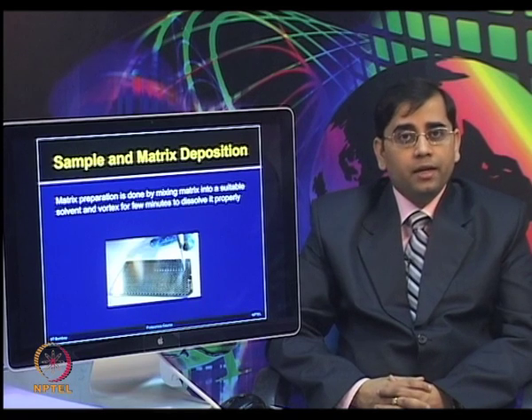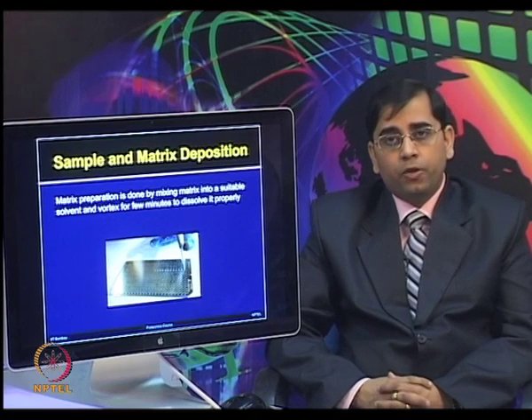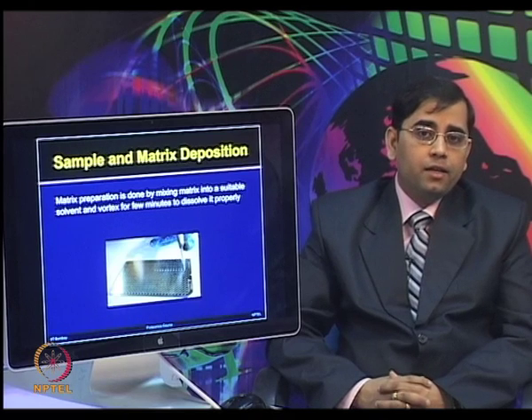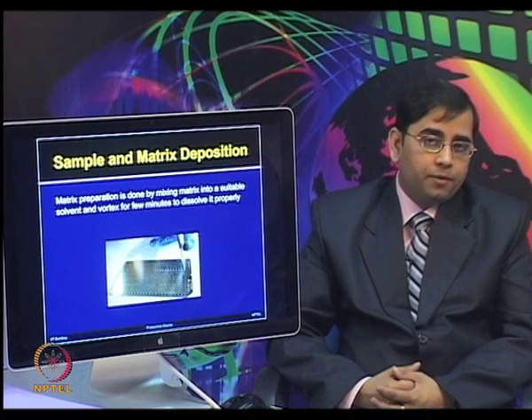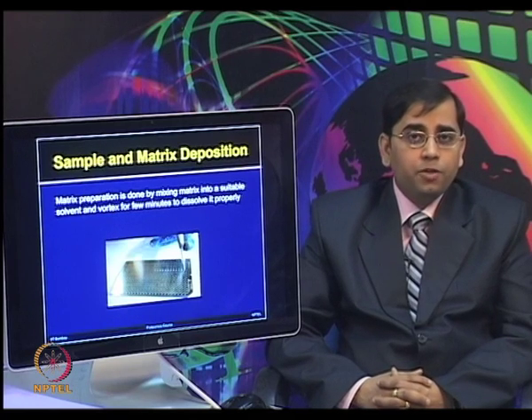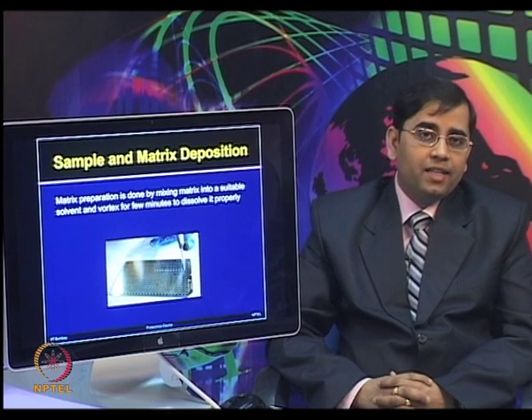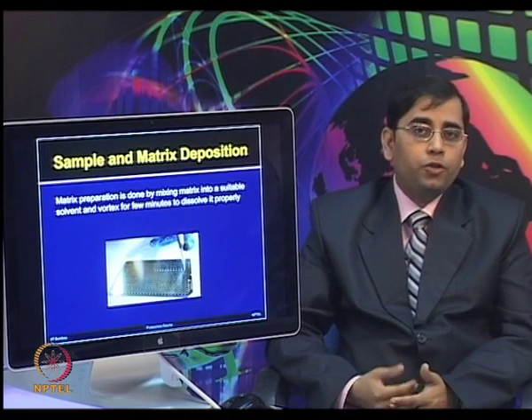But one can also try various combinations. In one approach, the sample is first deposited on the MALDI plate, followed by the matrix deposited above it, and then it is properly mixed before the drying process happens. Another way of doing this is the sandwich-based method, in which first a small amount of matrix is deposited on the plate, then you add the protein sample, and again the matrix is spotted on top of it.